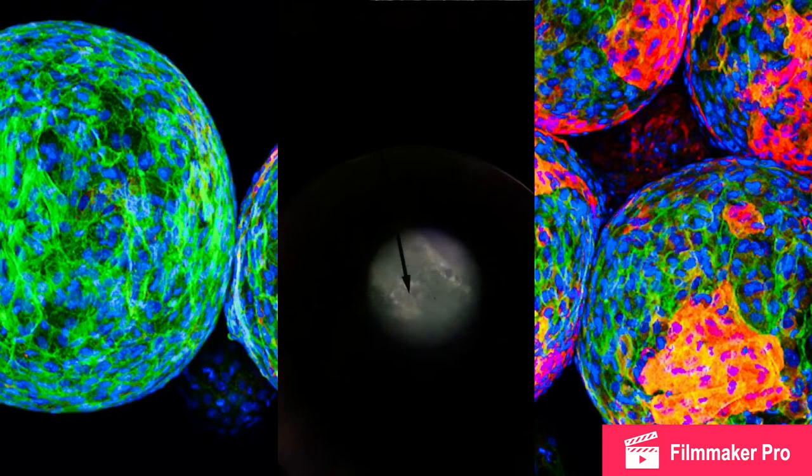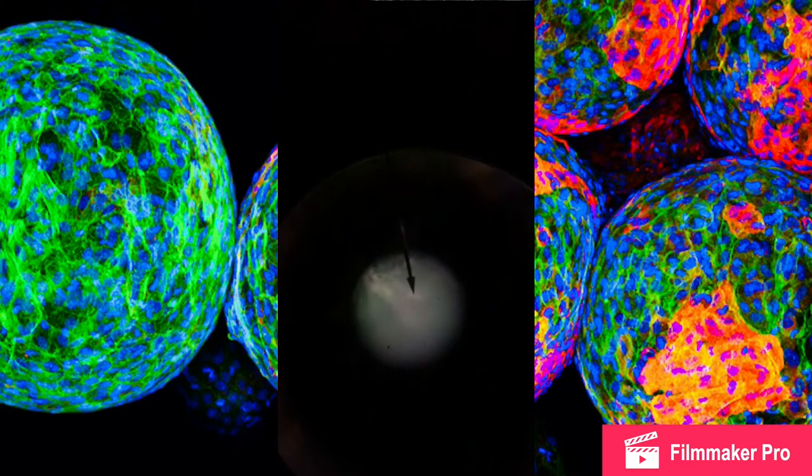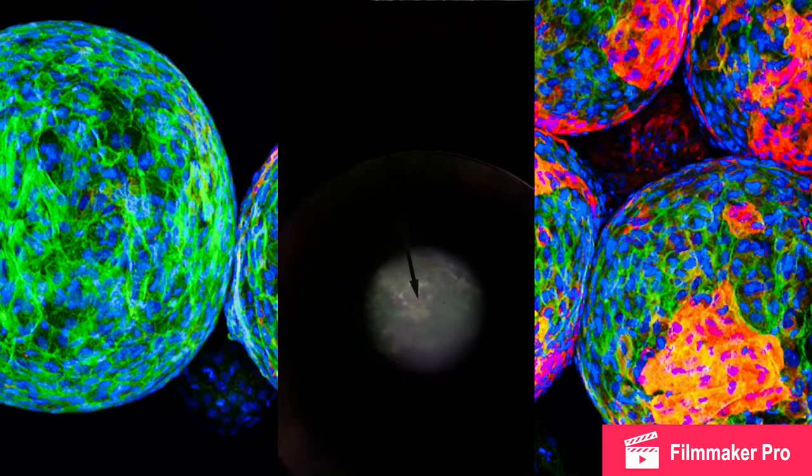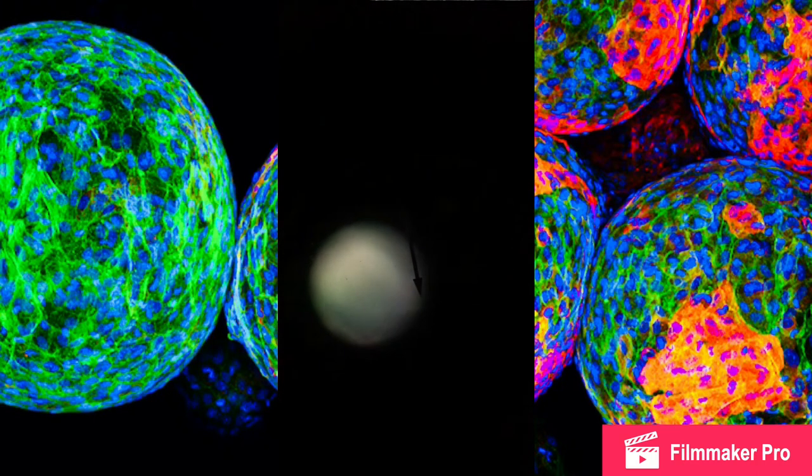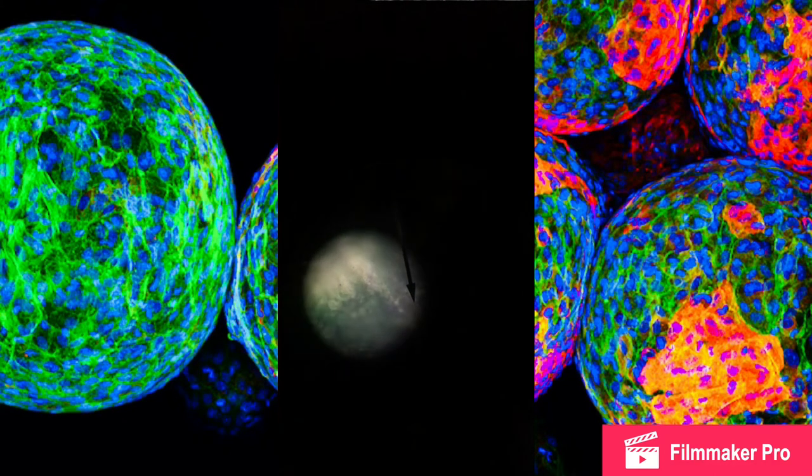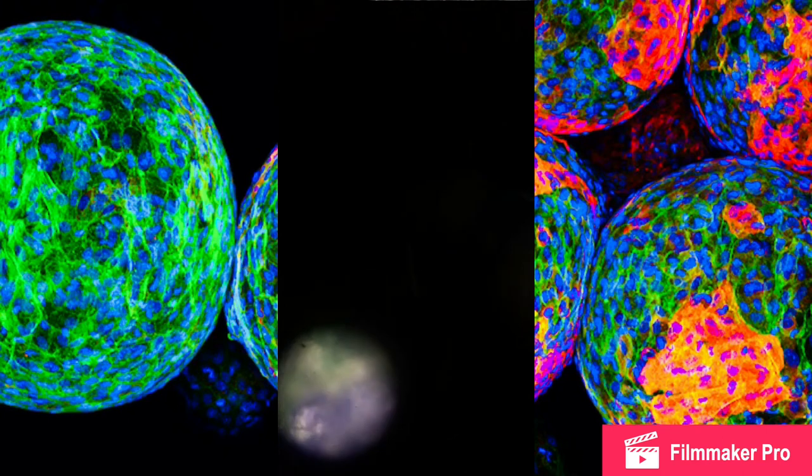I kind of wasn't expecting anything to show. Let's move it around a little bit. That looks weird, that looks weird.